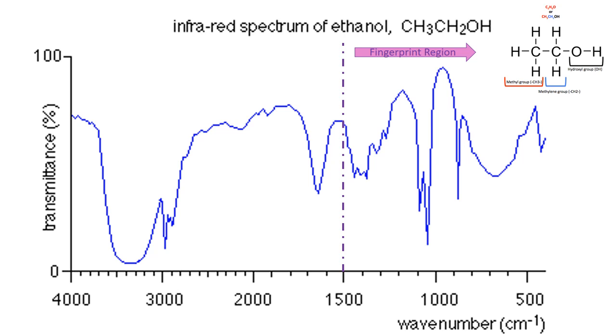That's the area which is unique to every compound which might go through one of these machines, and it tends to be the vibrations of larger sections, if not the whole molecule, which is what makes it unique, but also makes it a very confusing part of the spectrum to interpret with the reference numbers we use in A-level exam. So we tend not to look at that end of the spectrum.